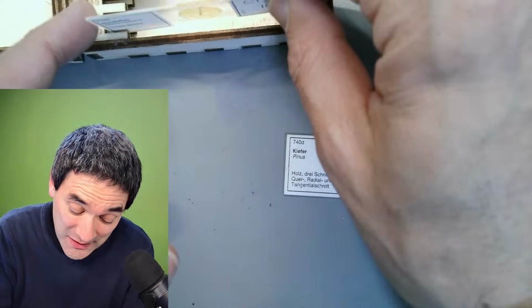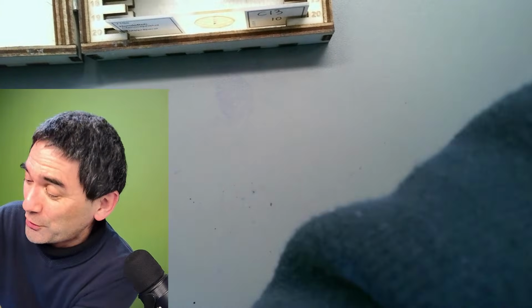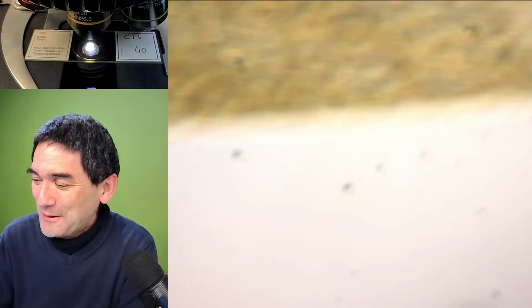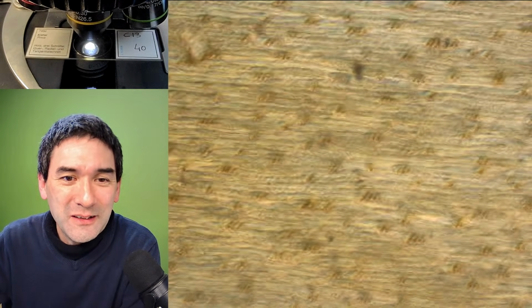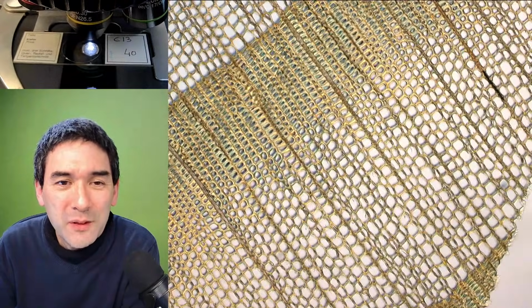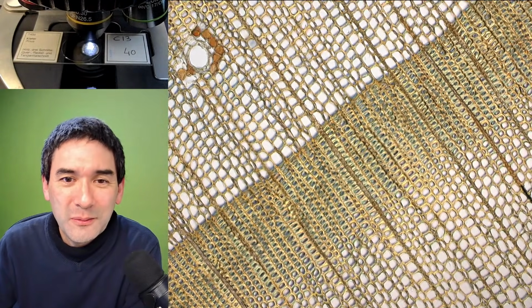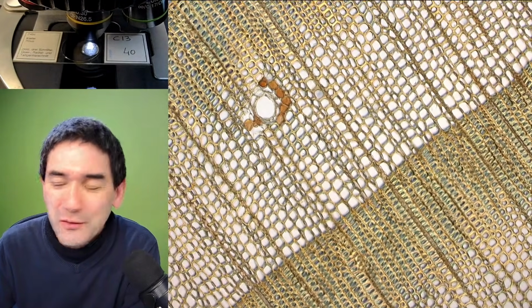Honestly, what I recommend for those folks who are starting out with microscopy is to just get yourself a box of slides, because almost nothing can go wrong. Especially if the slides are nice looking, they look extremely artistic. This one is also one where I've taken the picture, and you can hang it up on your living room wall.